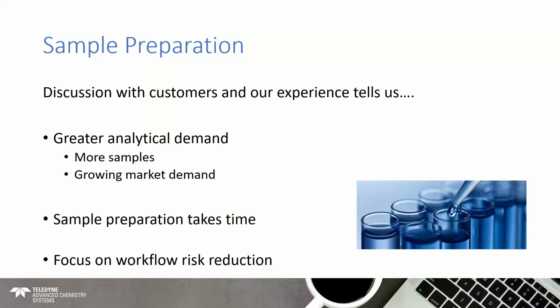If, for example, you have a set of calibration standards and they're not quite accurate enough, and there's too much variability on that line, that will have a knock-on effect to quantification of the analytes in your samples, and certainly the agreement with the known concentrations in your QCs. As a result, that will have a knock-on effect to the robustness of your analysis. So going back to the original requirements for the trace element laboratory: robustness of analysis, accuracy and precision. These are all key things for analysis. So there's a focus here on trying to avoid the need to reanalyze samples.